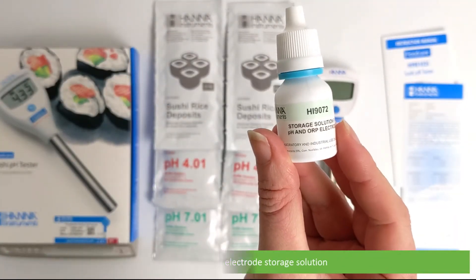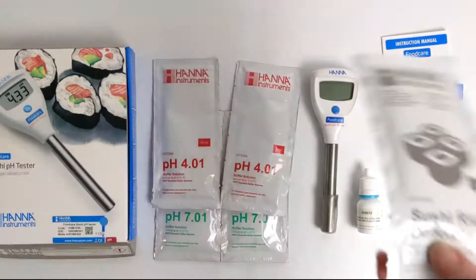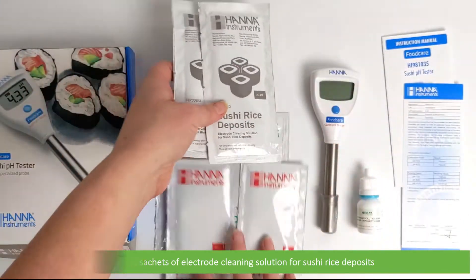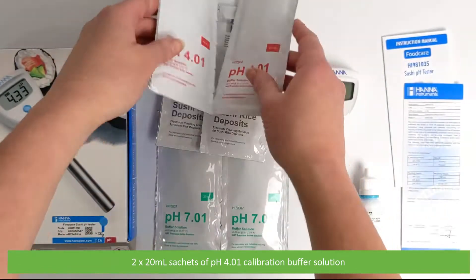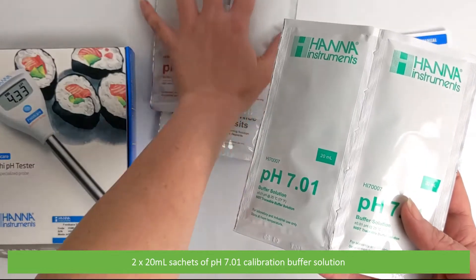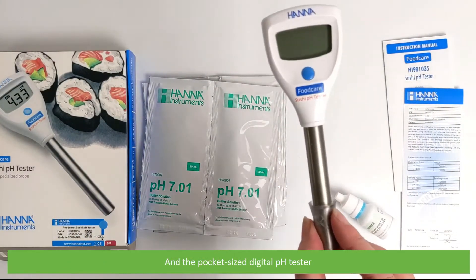Also included are two 20mL sachets of electrode cleaning solution for sushi rice deposits, two 20mL sachets of pH 4.01 calibration buffer solution, two 20mL sachets of pH 7.01 calibration buffer solution, and the pocket-sized digital pH tester.